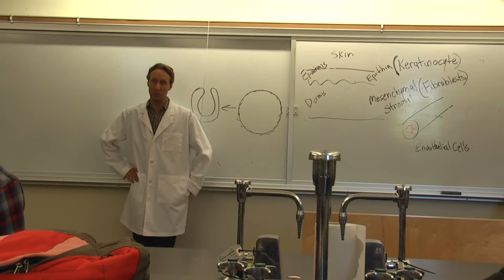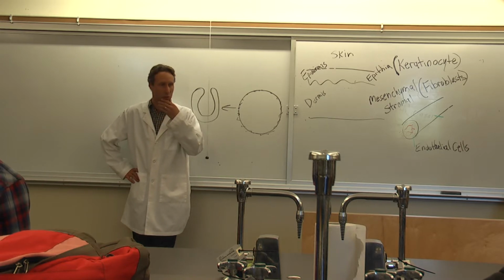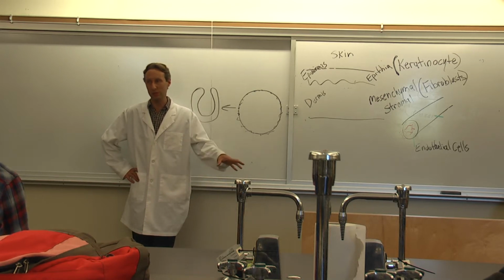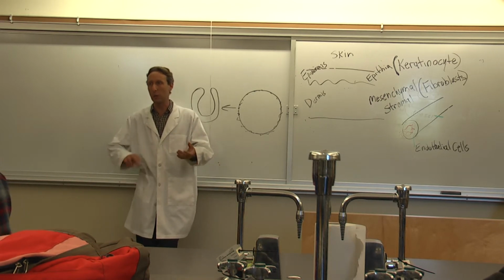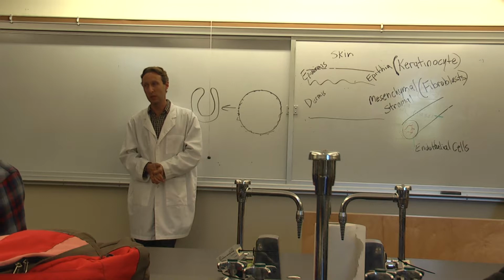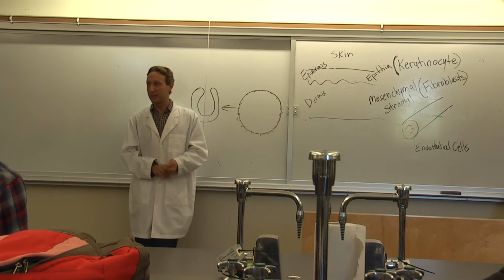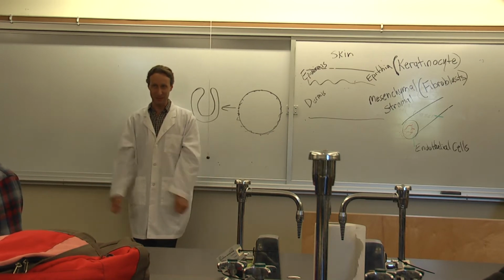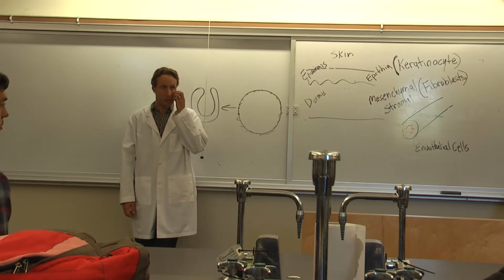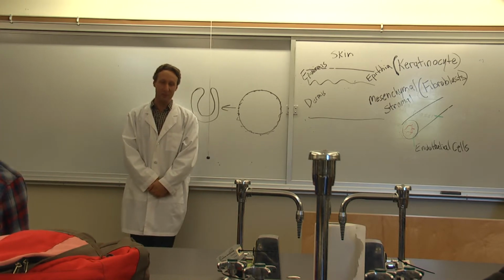What's going to be different is the specific hazards related to this research in particular. You're going to be doing a lot of these labs in your research lab, right? There are going to be some specific things related to instrumentation and waste disposal and those kinds of things that Dr. Hoffler will instruct you on as you get to those pieces. But you basically all know about no food or drinks, not running around, taking care of equipment, and where you're supposed to go in case there's a fire. So we don't need to do any of that. Is everyone clear on that? You sign off on that, that you know what to do? Okay, I know you guys have heard it a bunch of times.